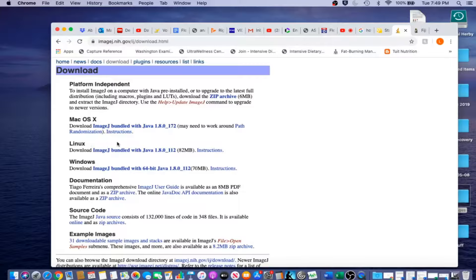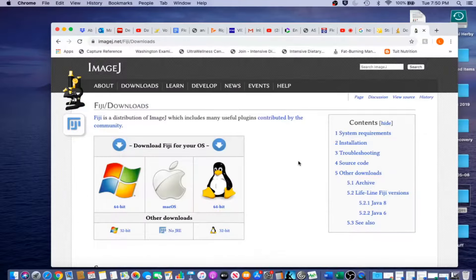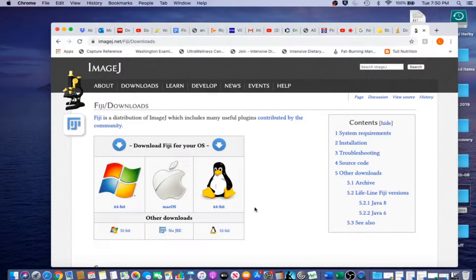It might be Windows or Linux. You click the link and download the program. Another possibility is to download Fiji, which is a batteries-included version of ImageJ that has many plugins already downloaded into the system. The procedure is the same — you go to the website, click the appropriate operating system, download, and open the program. You can also download other plugins into ImageJ, such as Weka Segmentation for training ImageJ to automatically process images.